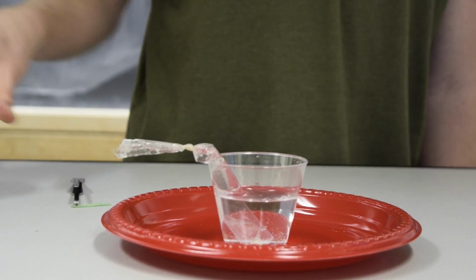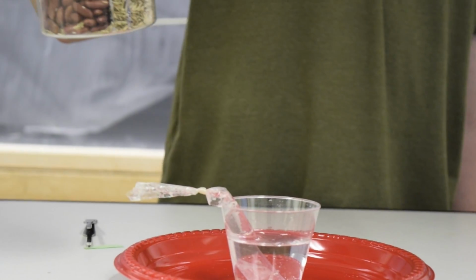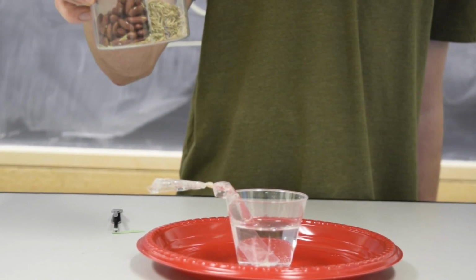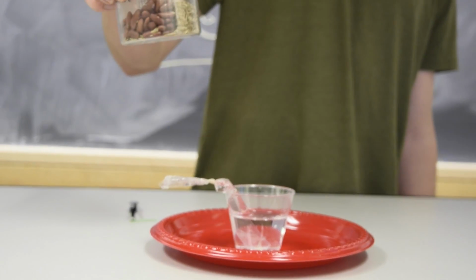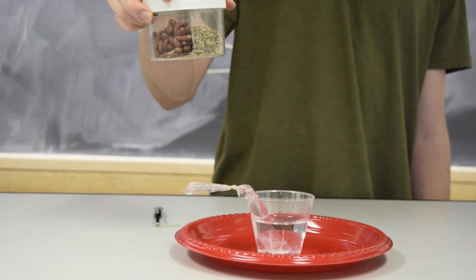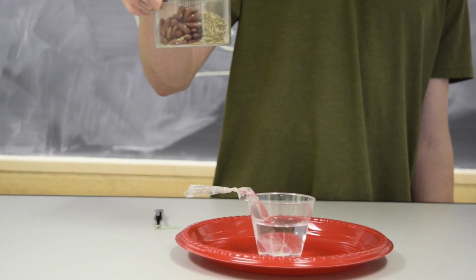Returning to the bean model, you should ask students which bean or seed represents the glucose in our dialysis tubing demo. The student should say that the small seeds represent glucose because it was able to pass through the dialysis tubing, like the small seed can pass through the wire mesh.